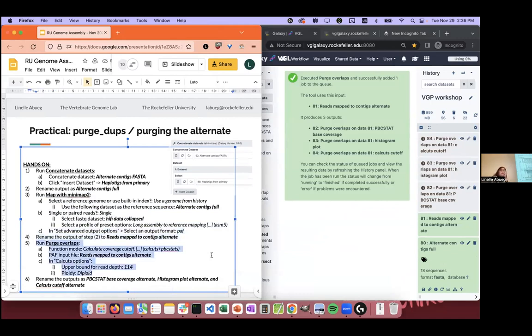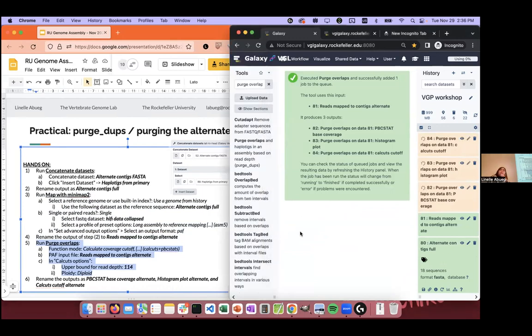Highlight this. Do you guys ever use lower bound? That's the junk parameter, the junk cutoff. I think it defaults to 5 at this point. We set it to like, I think 2, because nothing's going to have under that. And the coverage, right? Yeah, we lowered it after HiFi. If it's too high, we'll discard things that are real. But if it's too low, you'll keep junk, but we don't get a lot of junk with HiFi.